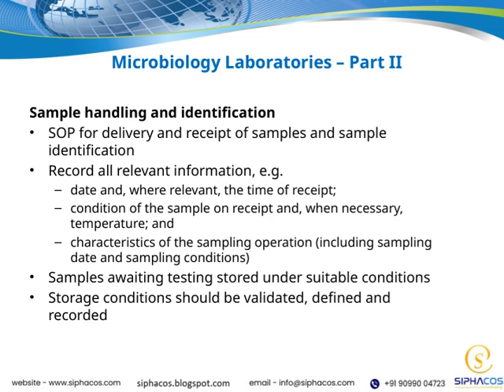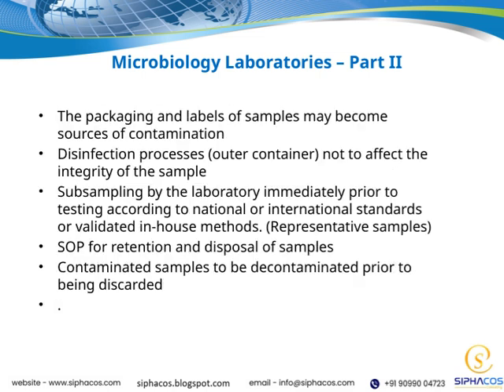This process is fundamental in microbiology laboratories, as proper sample handling and identification directly impact the reliability of our testing and results. By following these protocols, we uphold the quality and safety standards that are central to our overall approach. When handling samples, it's important to remember that packaging and labels can sometimes become sources of contamination. So, we need to be cautious and ensure these are properly managed.